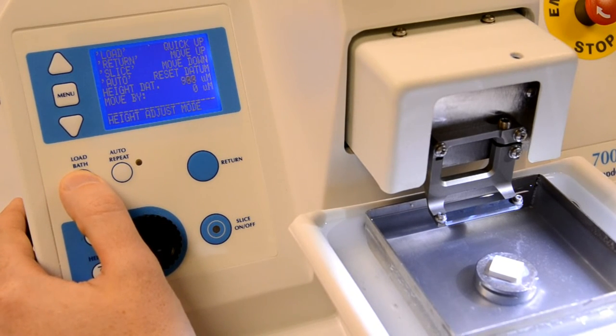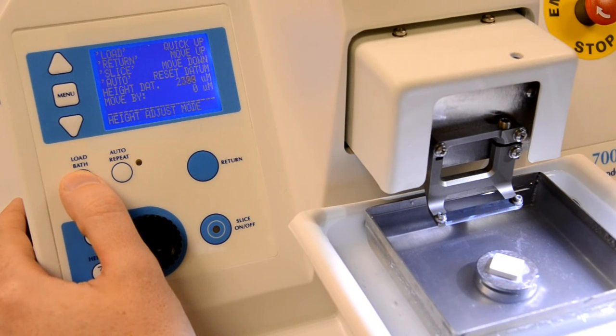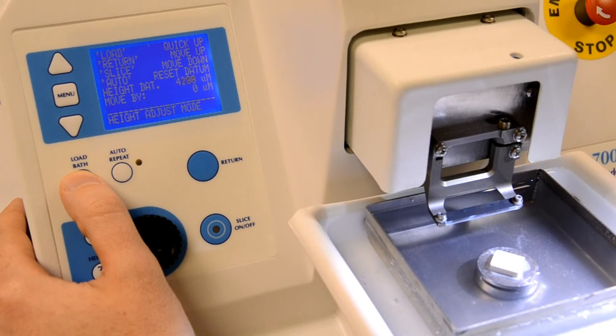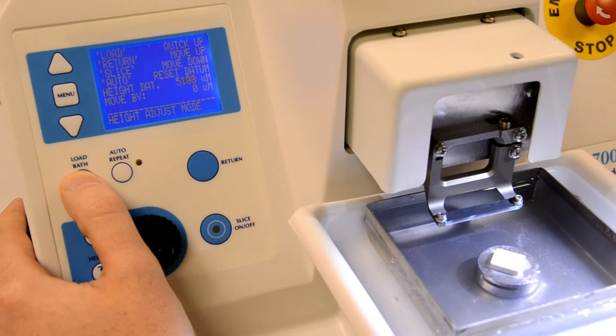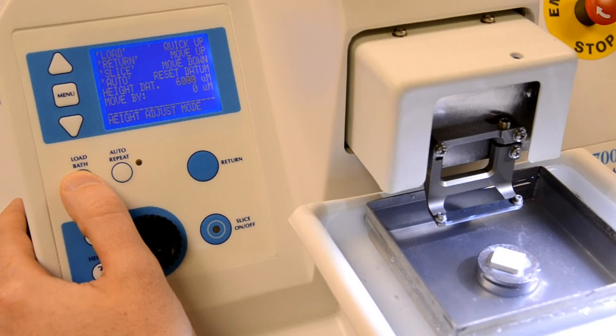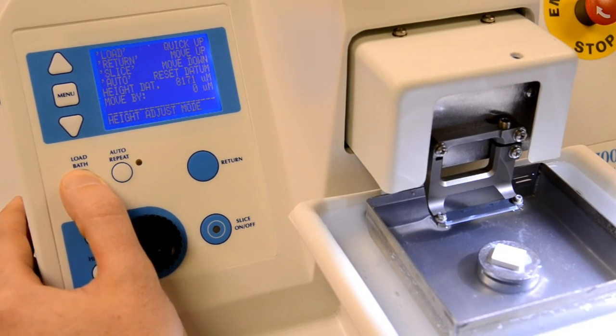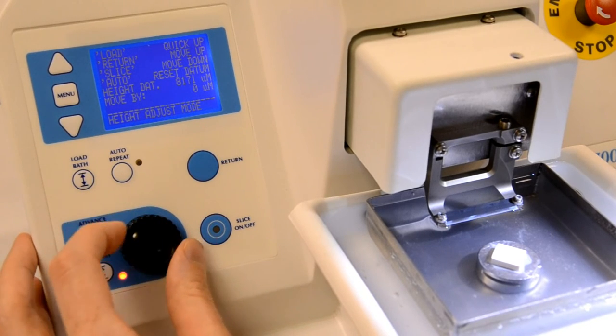Next we need to bring the specimen to a suitable start height by entering the height adjustment mode. To do this, press the height key. Press the load bath key and the bath will begin to rise. Press the load bath key again to stop it.